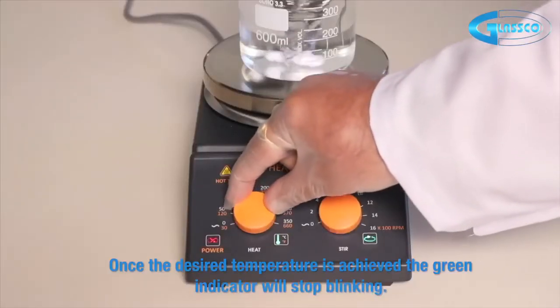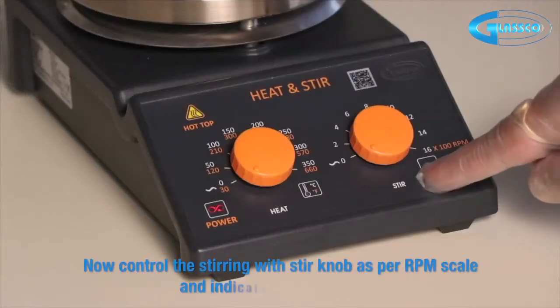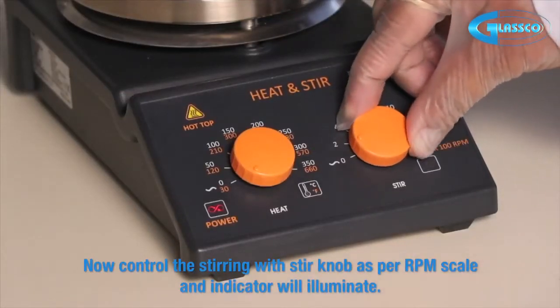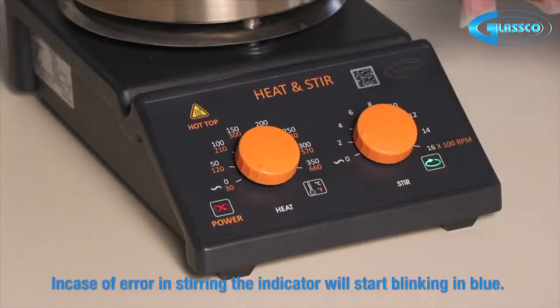Once the desired temperature is achieved, the green indicator will stop blinking. Now control the stirring with the stir knob as per the RPM scale, and the indicator will illuminate. In case of an error in stirring, the indicator will start blinking in blue.